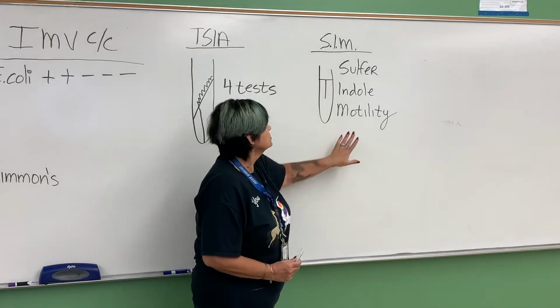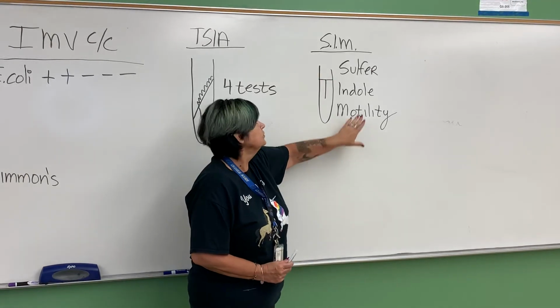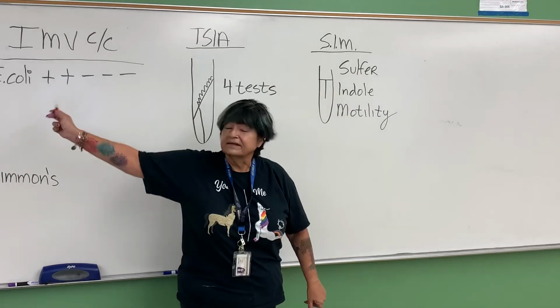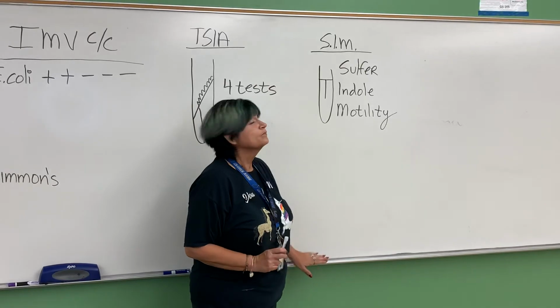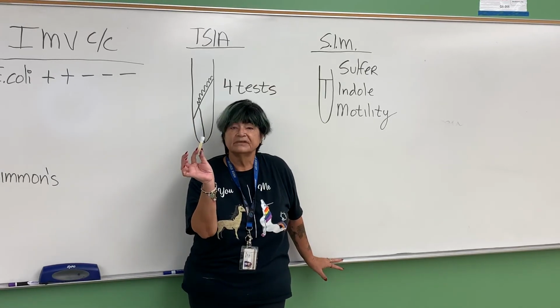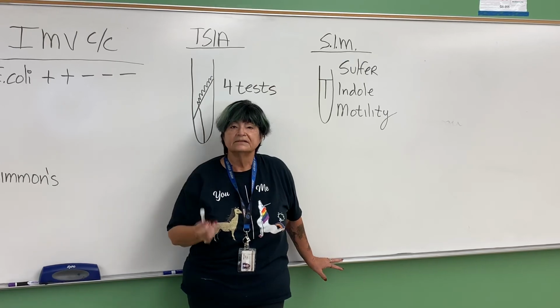Next week, so there's 3 tests in this one. You're testing for sulfur, indole, which is the same as that indole, and motility. So next week, we'll show you an SIM tube that has bacteria growing in it. Okay.